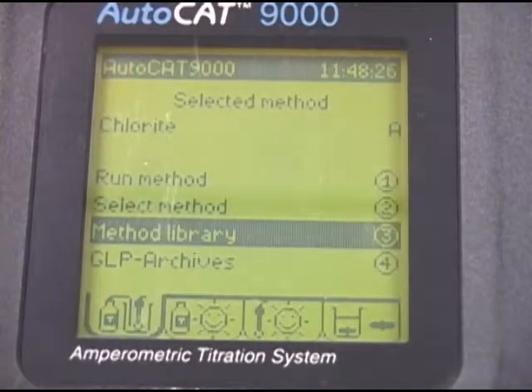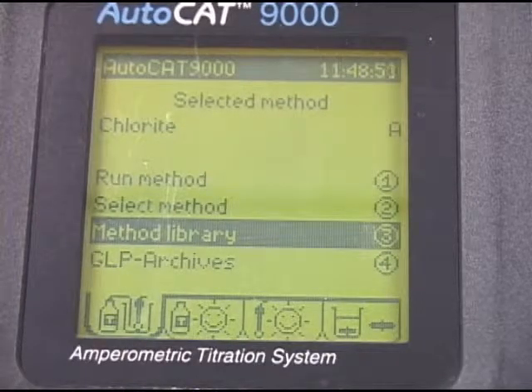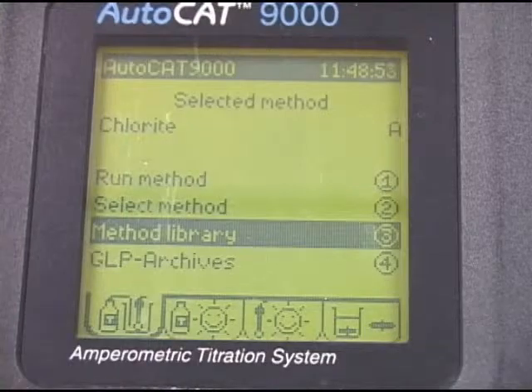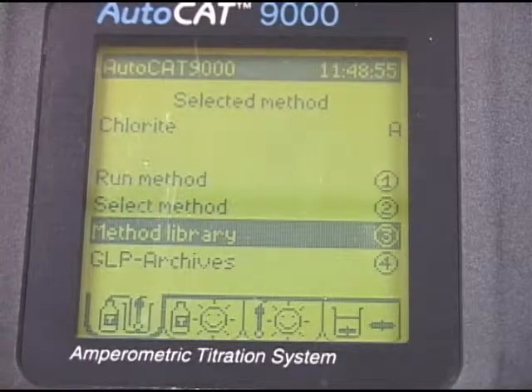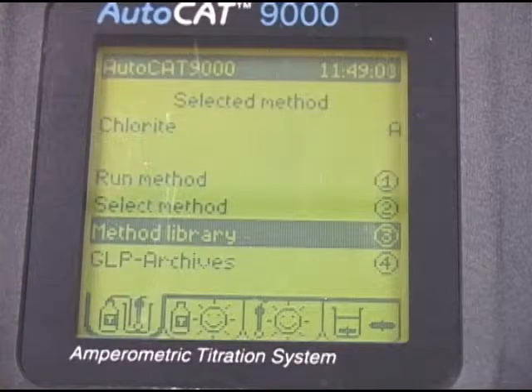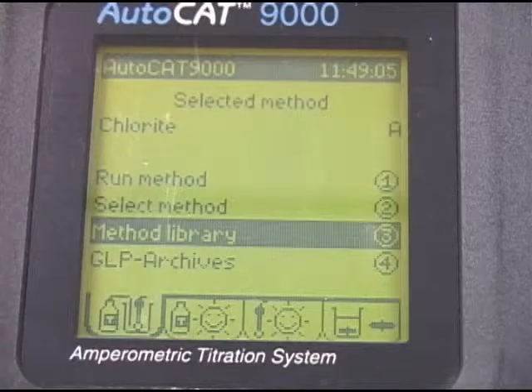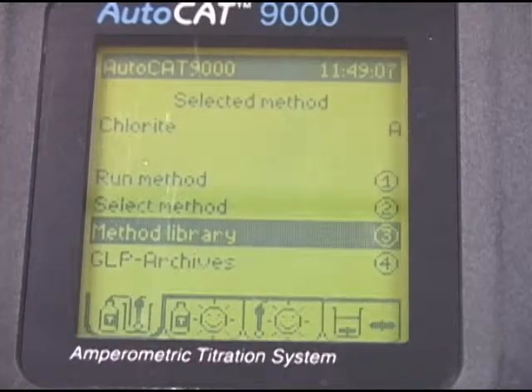the main menu. Changing these parameters helps the AutoCAT to avoid false endpoints at the very low level concentrations. What it also will help you do is to speed up the analysis. Do not try changing other of those hidden parameters, or you may cause problems to the AutoCAT that would give you false answers on normal runs.